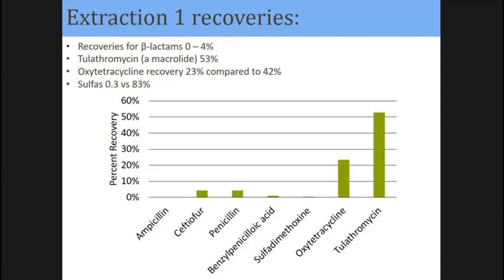Oxytetracycline recovery was 23%. And in this paper, they found recovery of 42%. So we recovered half as much as they recovered. And then of this, we got 0.3% recovery of the sulfa. In the paper, they recovered 83%. And so already, you know, you're thinking, well, awesome.